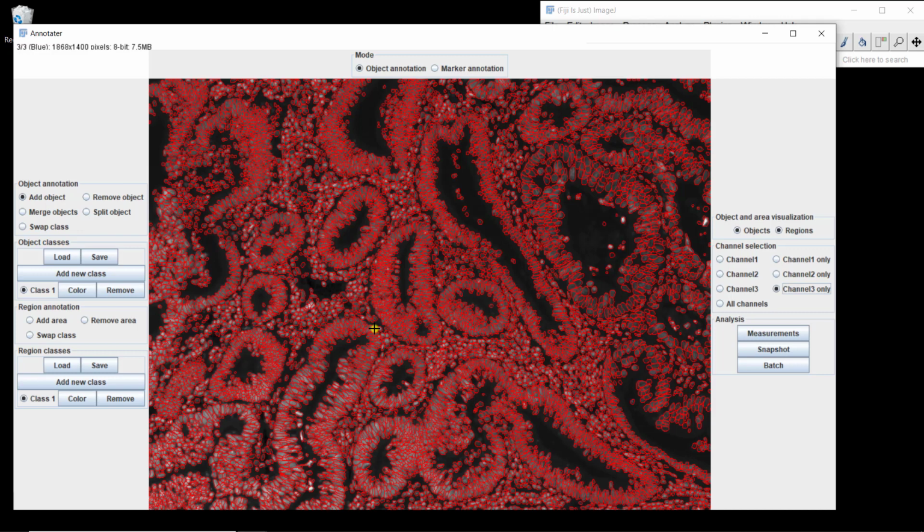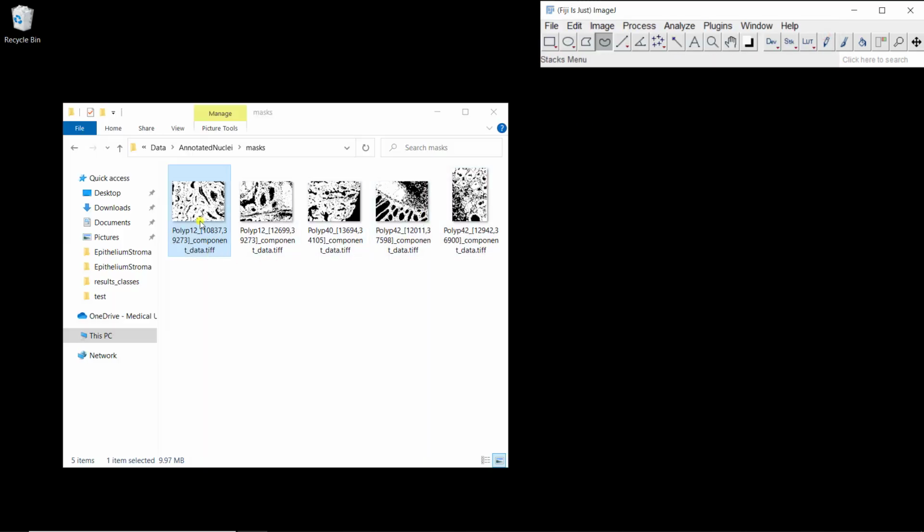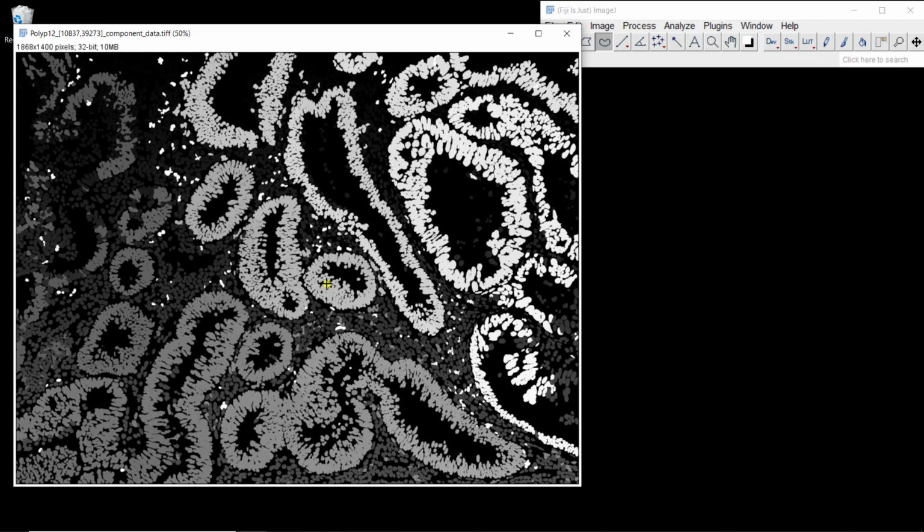The thing is, that's very useful for instance segmentation, but here we use U-Net, and with U-Net we do semantic segmentation. So let's just close this and go back to the mask we have. Clearly we cannot use this directly with U-Net because here we have a different intensity for each individual nucleus, but with U-Net we're going to estimate a class at each pixel and not do instance segmentation like we have here.